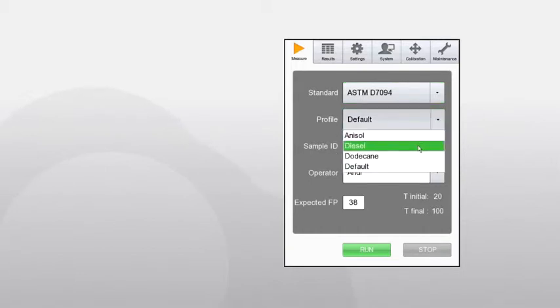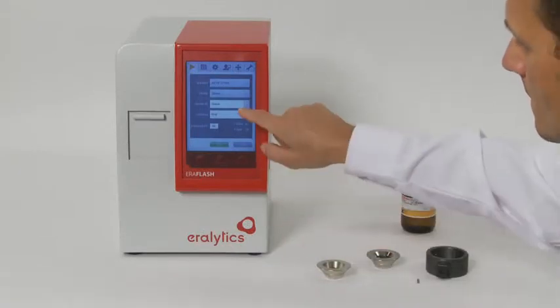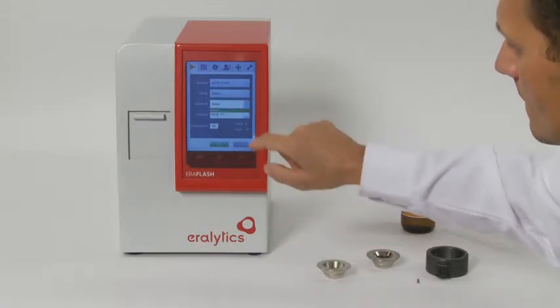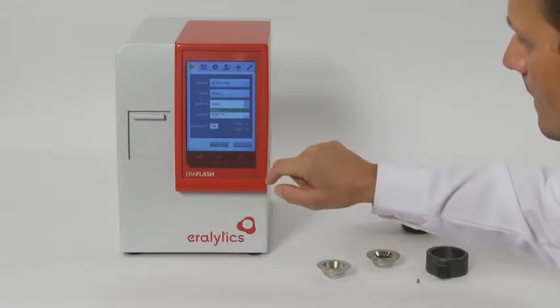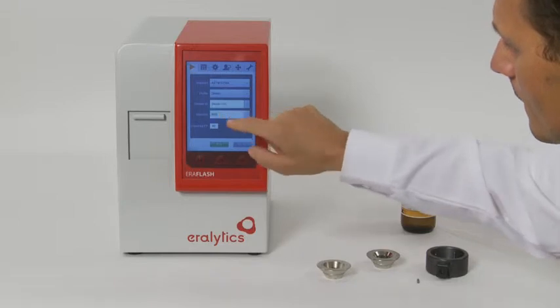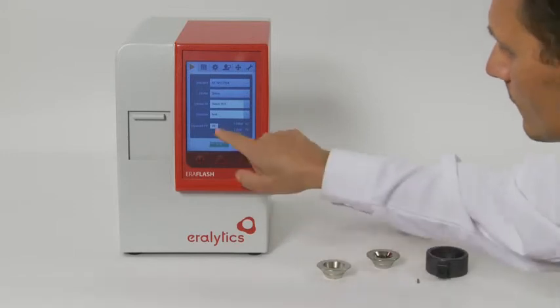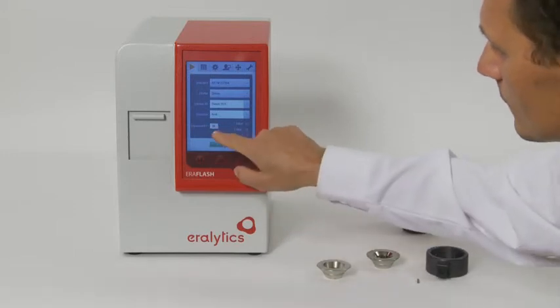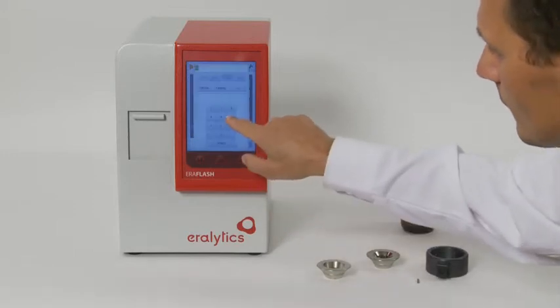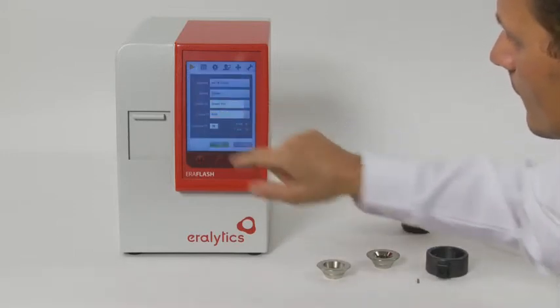A measuring profile allows the pre-selection of the sample IDs and the suitable measuring range. Detailed programming of the profile can be done in the settings menu. Enter the sample ID and the operator on the pop-up keyboard or select them from the drop-down list of previously entered names. If the preset expected flashpoint does not fit the test at hand, it can be adjusted as needed.